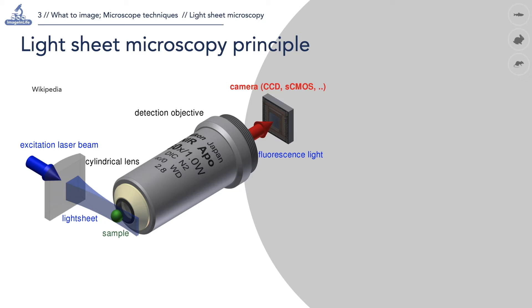The possibility to image a whole plane at once confers the highest imaging speed compared to point laser scanning confocal microscopy.